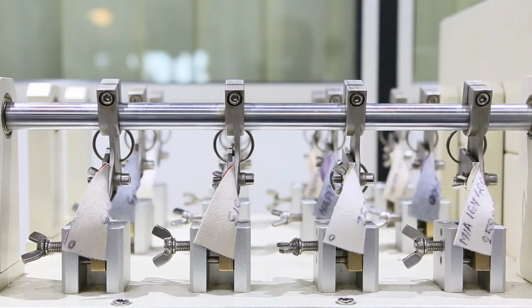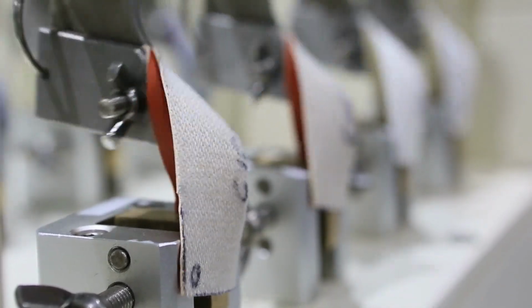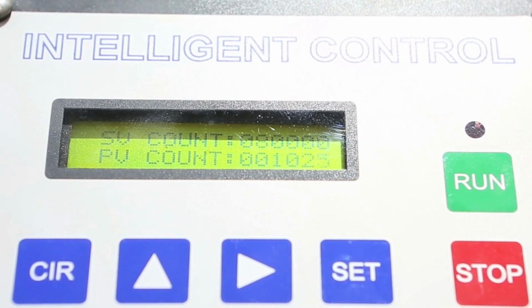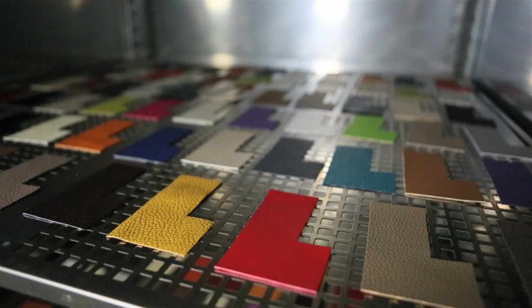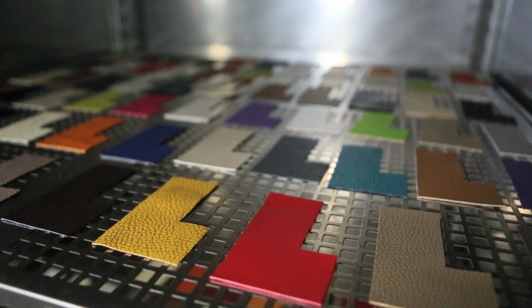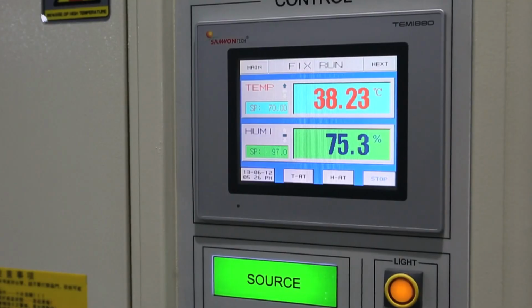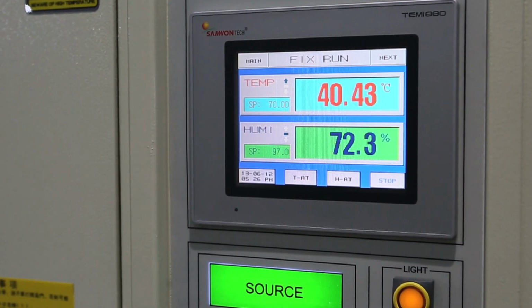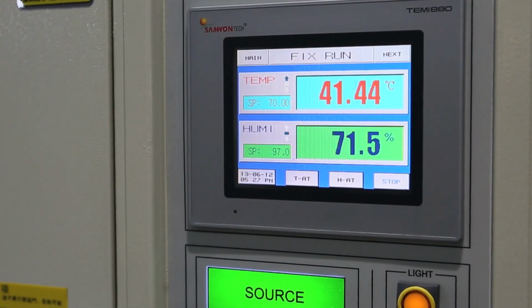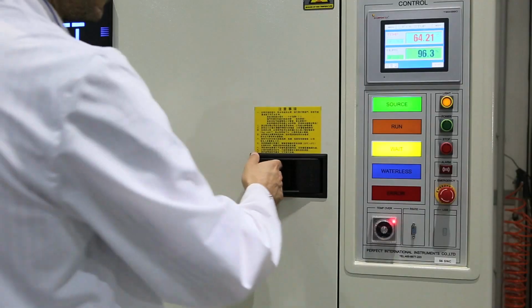In the case of leather and eco-leather, instead, Aurim regularly uses the flexometer in order to measure the product's resistance to repeated flexing. The samples are tested both before and after having been conditioned inside a climatic chamber with controlled temperature and humidity that simulates hydrolysis, an accelerated aging process. The product remains inside the chamber for 336 hours, returning afterwards to the flexometer for further testing.